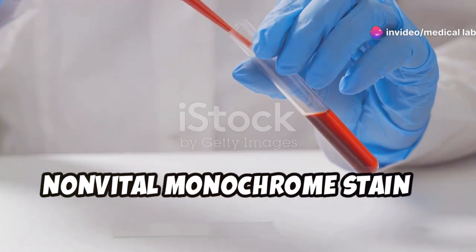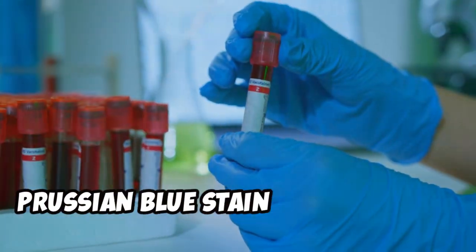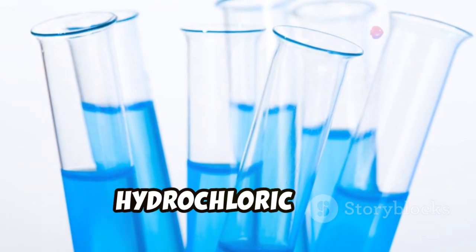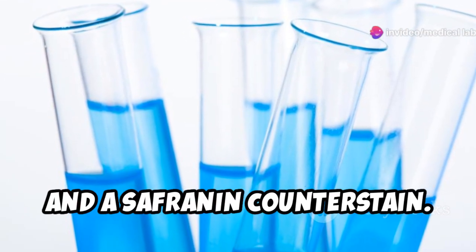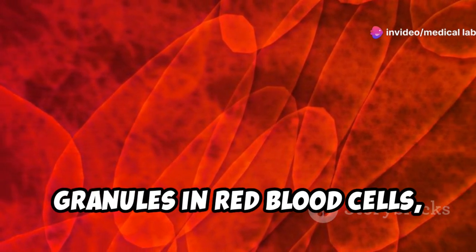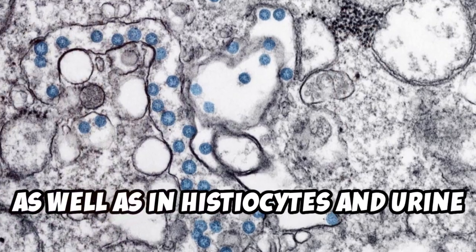Non-vital monochrome stain is used to stain specific cellular components. Prussian blue stain is an example. It contains potassium ferrocyanide, hydrochloric acid, and a safranin counterstain. This stain is used to visualize iron granules in red blood cells, known as siderotic iron granules, as well as in histiocytes and urine epithelial cells.